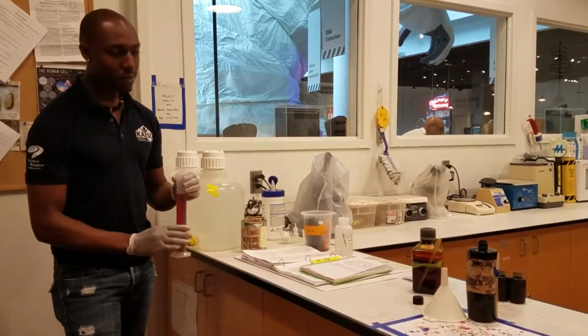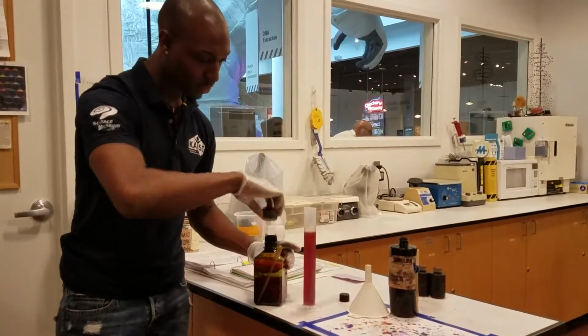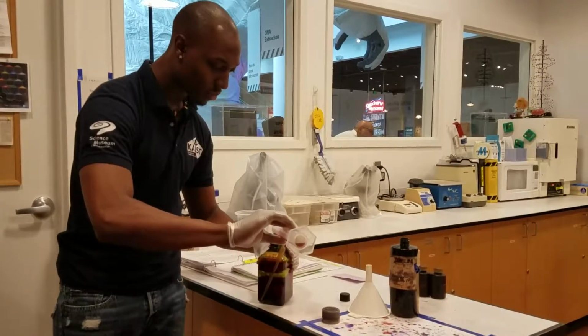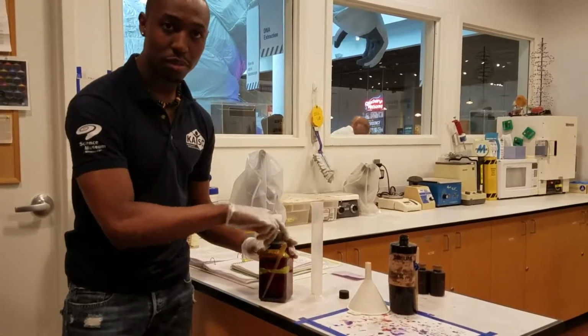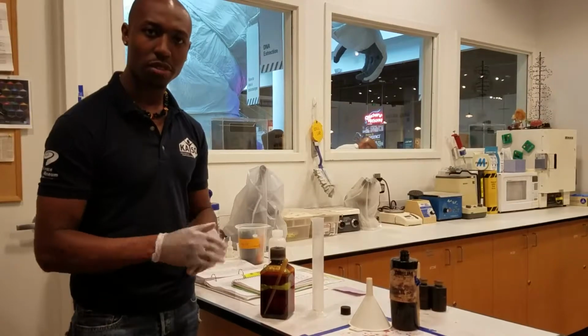Once you're done, just simply add it to the jug here. Bam! Lugols solution done. Place your materials away, wash your hands, all done.